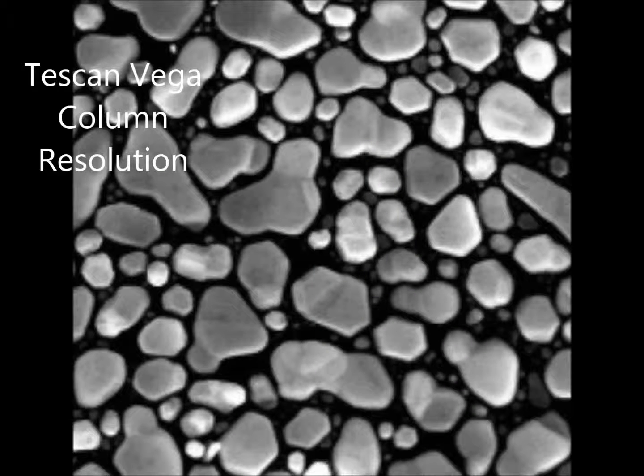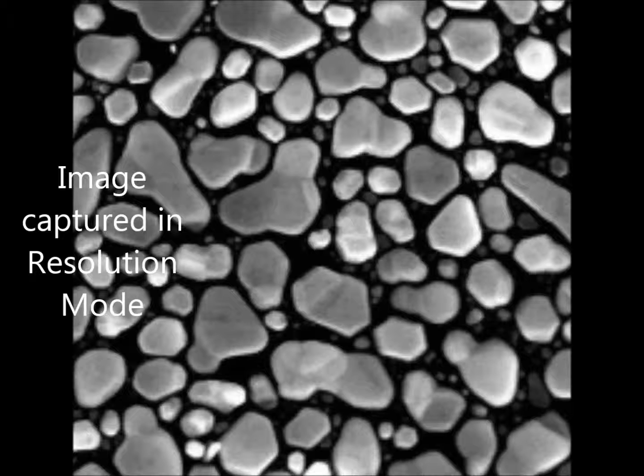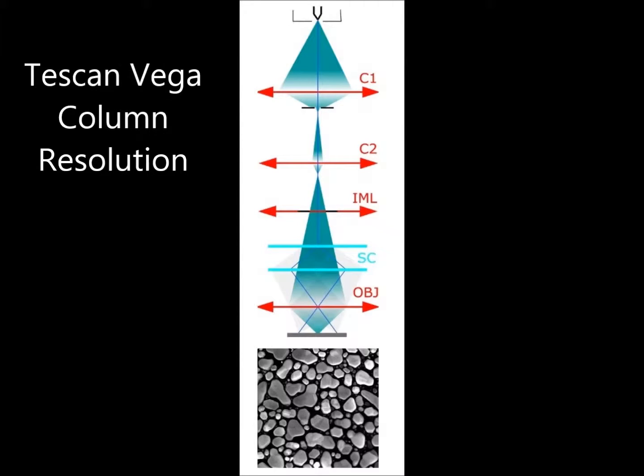The aperture is nearly optimal for lower beam intensity values with a small spot size, a low beam current, a short working distance of about 4 to 5 millimeters, and an accelerating voltage of 30 kV. The pivot point of the scanning and the electron image shifts are close to the principal plane of the objective so that the field of view will be as good as possible. The centering of the objective is performed by a defined beam tilt of the central electron beam, which does not cause the image shift. This mode is intended for displaying with the highest resolution.